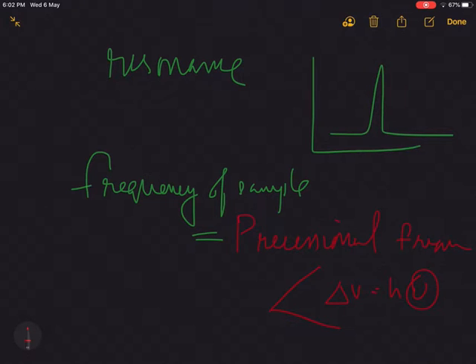When the precessional frequency matches the frequency of the instrument, which is constant for a particular instrument, then we say there is resonance. Nuclear magnetic resonance spectroscopy means we are studying the nucleus, therefore the term nuclear. Then a very powerful magnetic field strength is given, which is why there is the term magnetic.